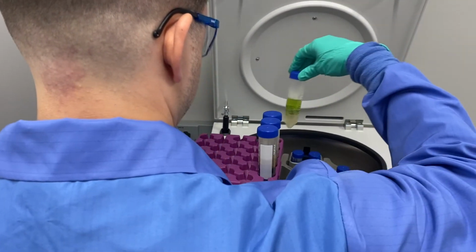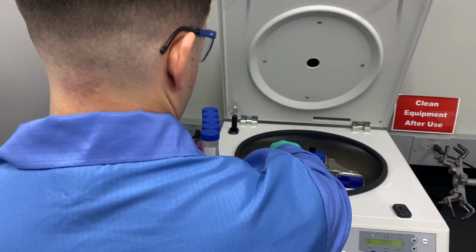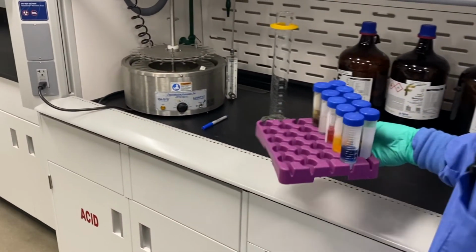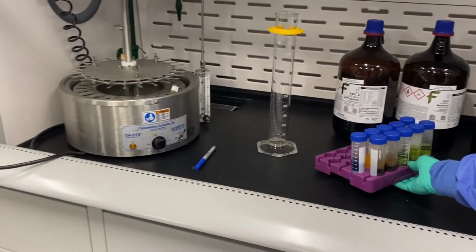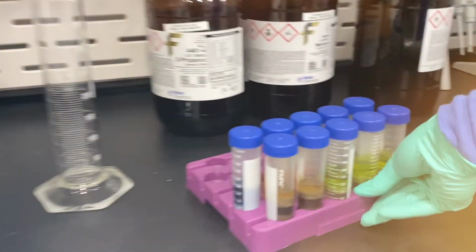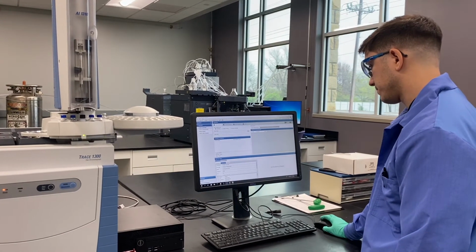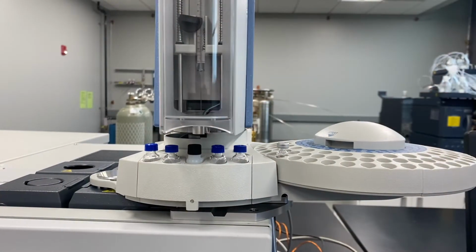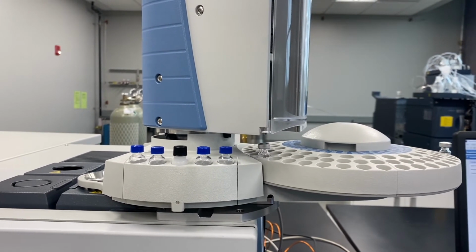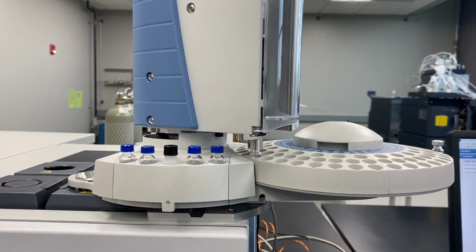The lab receives a wide variety of samples that are related to cases of pesticide drift complaints. These samples could be environmental swabs, soil, vegetation, water, or clothing. The lab also receives pesticide products from manufacturers or retailers. When we receive these samples, we analyze the contents of the container and then compare the results to the product label. Testing in this lab protects plant health, reduces environmental threats, and ensures product reliability for consumers.